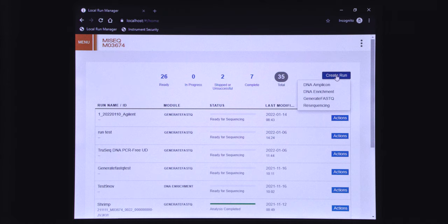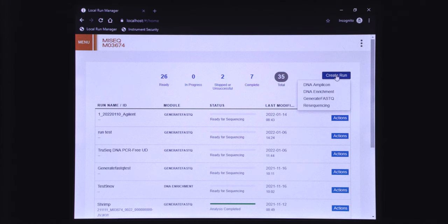The local run manager software uses different analysis modules to perform data analysis. You can download the modules from the local run manager support page on the Illumina website. In this video we will use the generate FASTQ module.